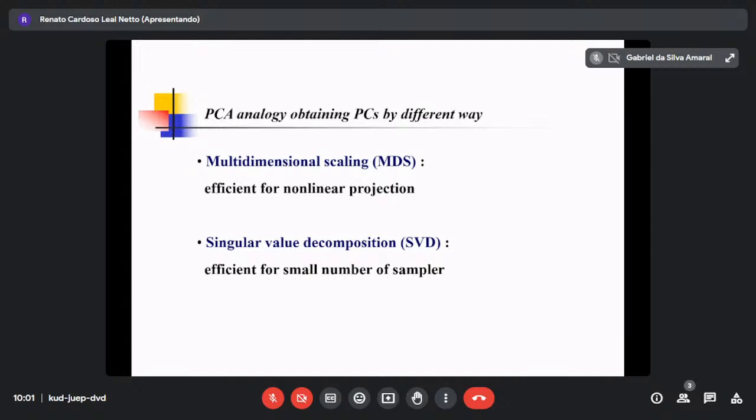But the second one is, if your data, for example glucose level, does not follow a first-order projection, you want to draw the projected line not as a first-order line but a second-order or third-order line, then you can use this one. But nowadays, very few people are using this method. So she can forget about it.